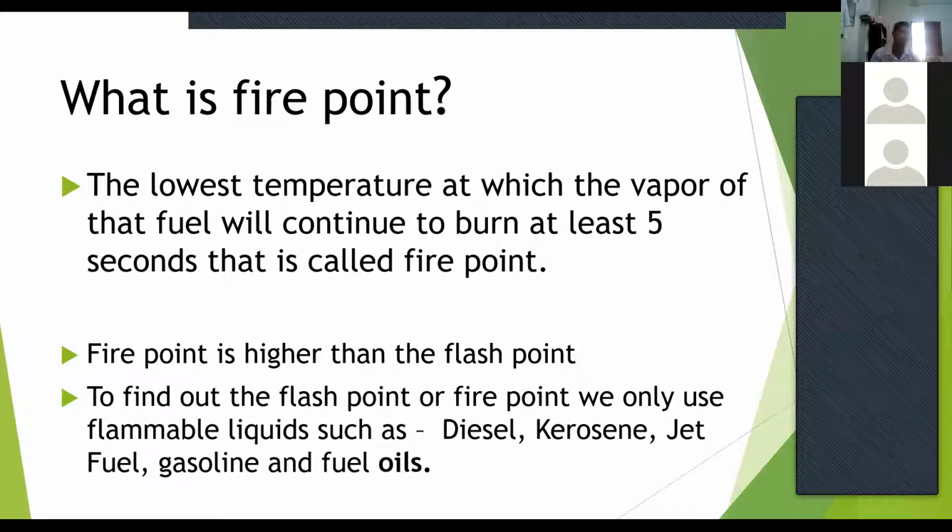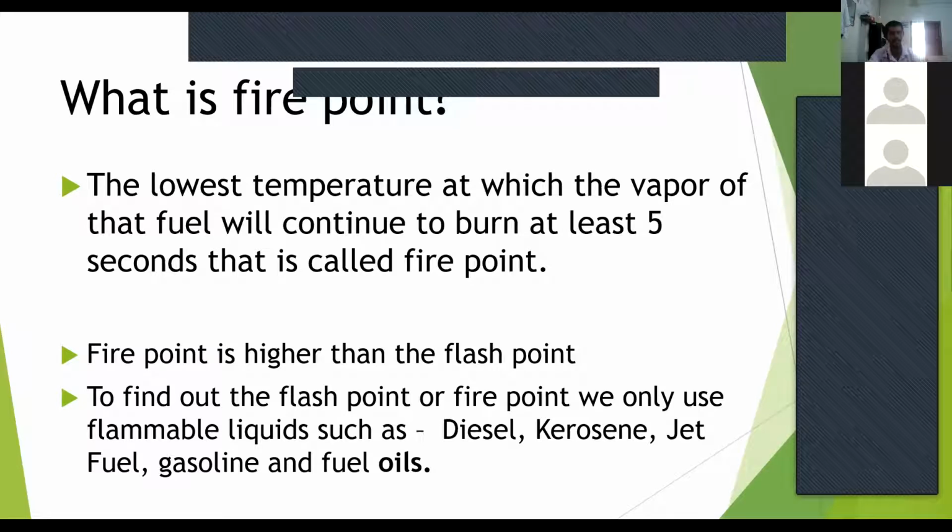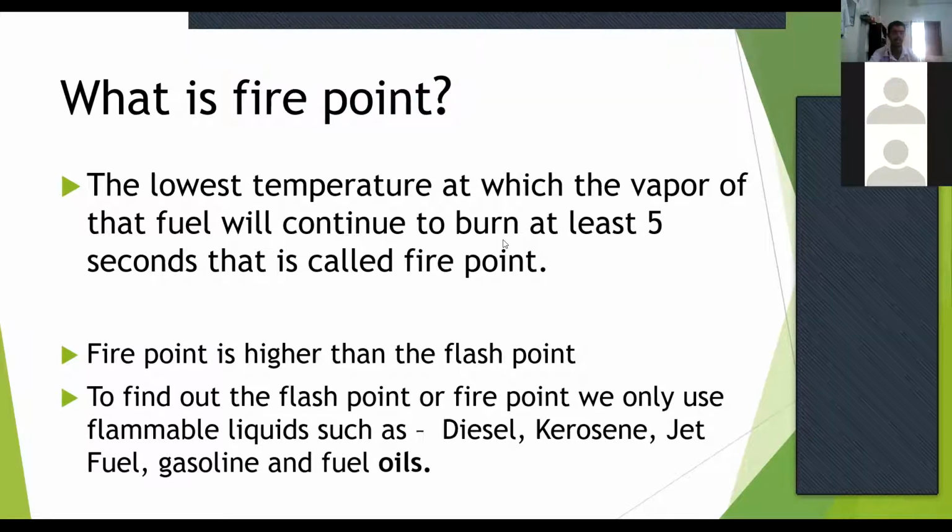If you don't know the flash point of a certain fuel, it is very dangerous, because at any time it can blast or cause a fire. I already told you, the fire point is always higher than the flash point.